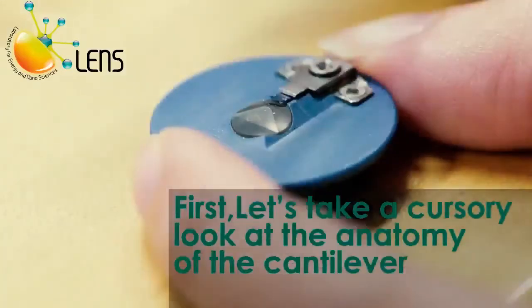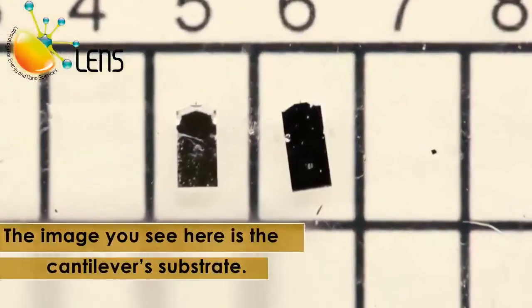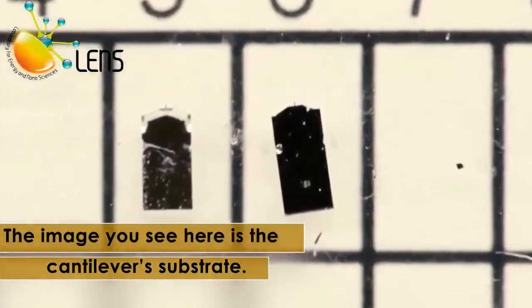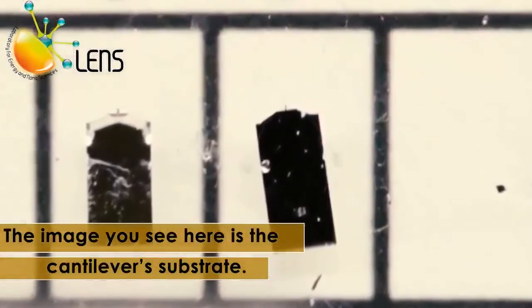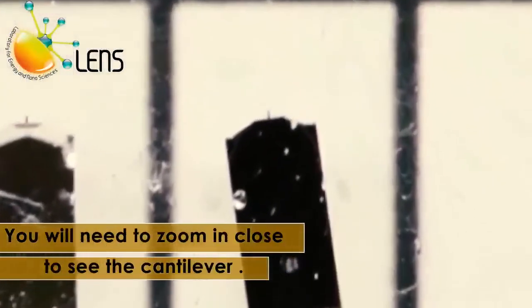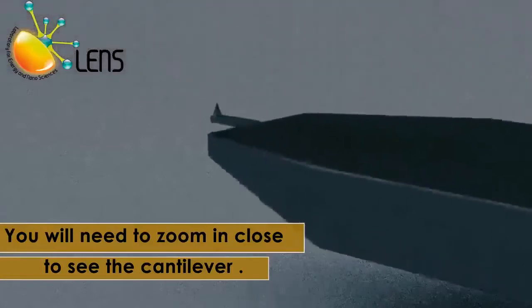Before we get into the process, let us take a cursory look at the anatomy of the cantilever. At first glance, the image you see in this picture is the substrate. You will need to zoom in really close to see the cantilever at the tip of the substrate.